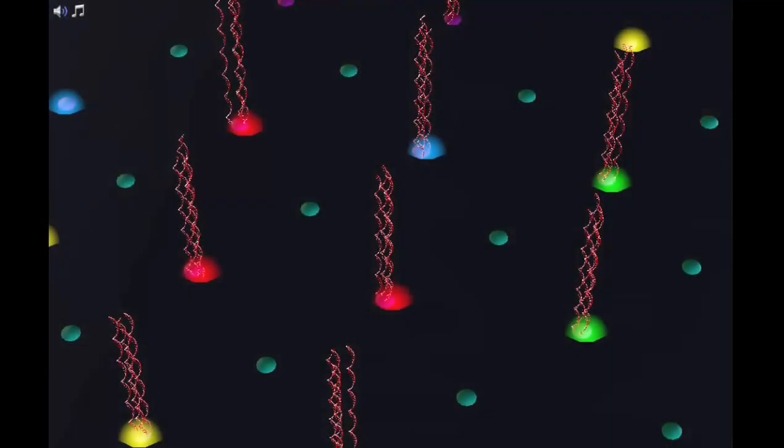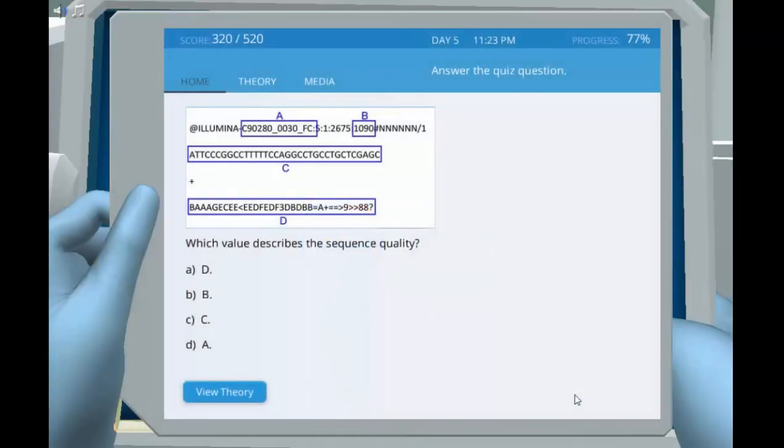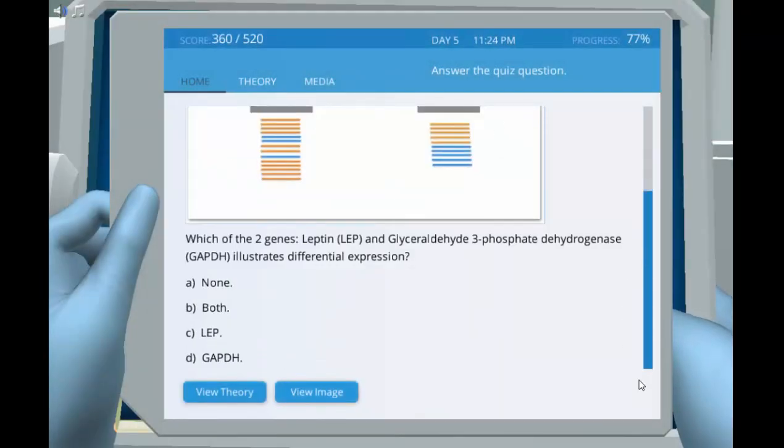They will also learn how to analyze the data from the experiments, understanding how mRNA relate to the gene expression levels and how this can affect obesity.